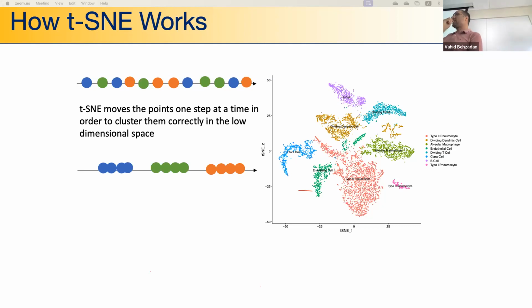What I'm saying is that that's unlikely to happen because it's very difficult to find rare cells with these simple or just computational approaches.